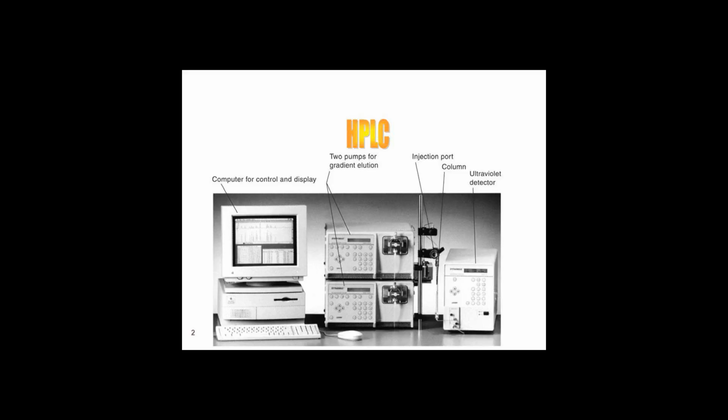This form of chromatography is widely used in the following applications: water purification, pre-concentration of trace components, ligand exchange chromatography, ion exchange chromatography of proteins, high pH anion exchange chromatography of carbohydrates and oligosaccharides, and others.